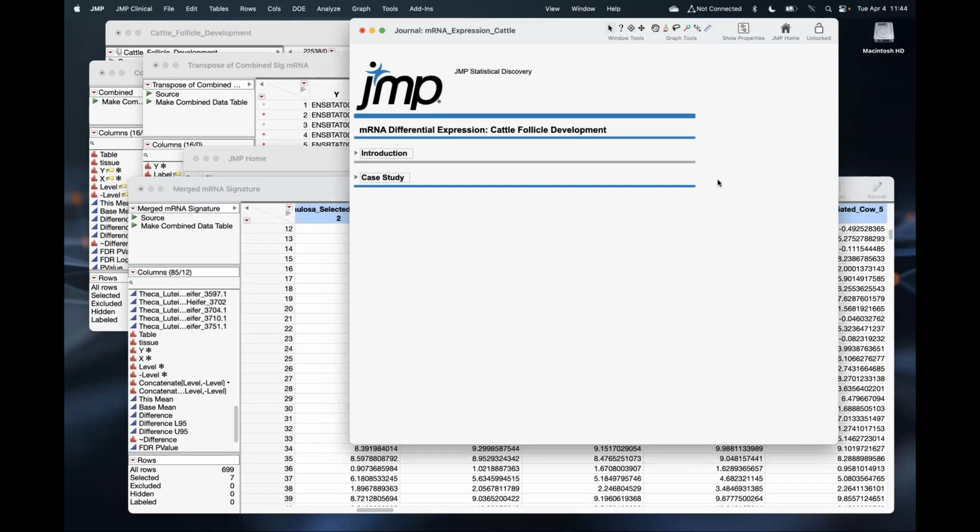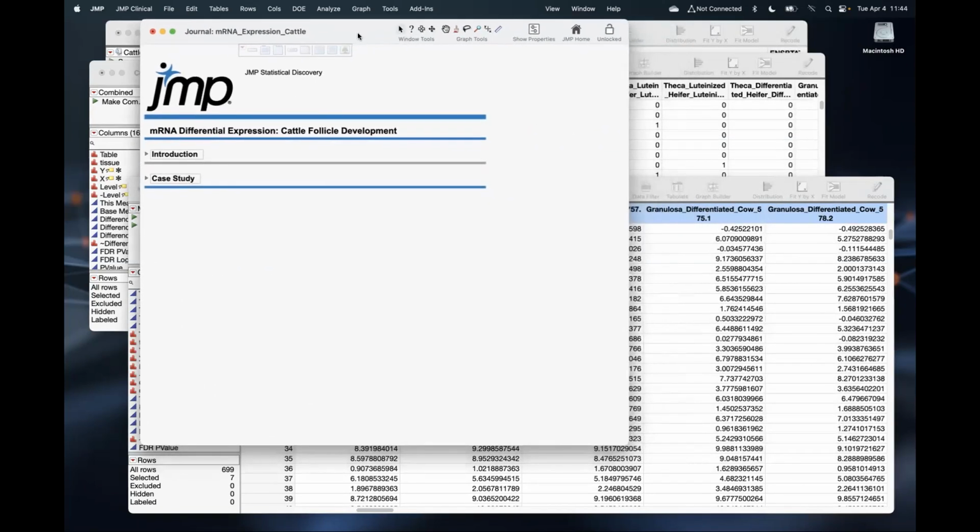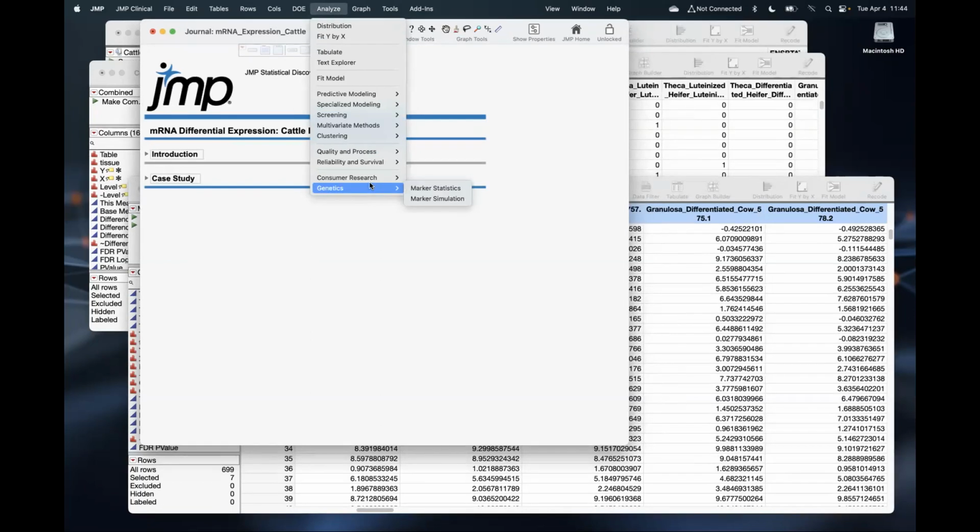That's pretty good. So right now, the ones I've showed you are gene expression. My next use case, which is pretty quick, we'll start talking about genetics. So starting with allele or allelic information, and we'll be able to use things, which you'll see here under genetics. So basic marker statistics, right? Just get your Hardy-Weinberg equilibrium tests. We'll do that. You'll see that we're going to go back to response screening again to do our GWAS.